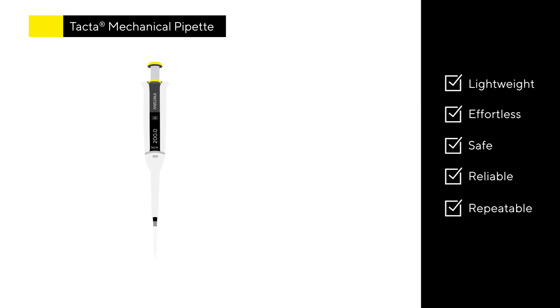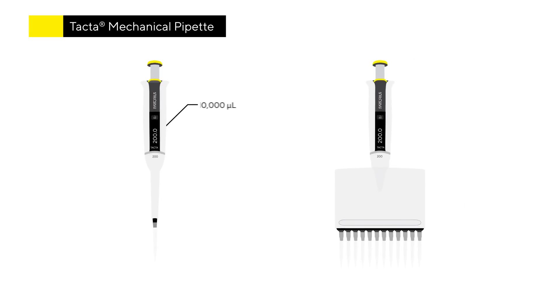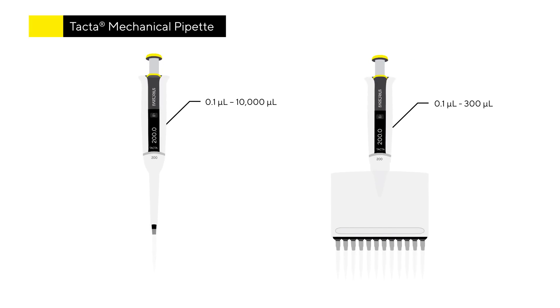Available in both single and multi-channel models, with a variety of volume ranges, pipettes can be optimised to match your needs.